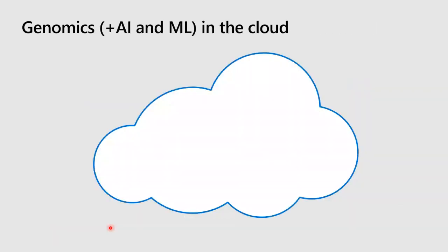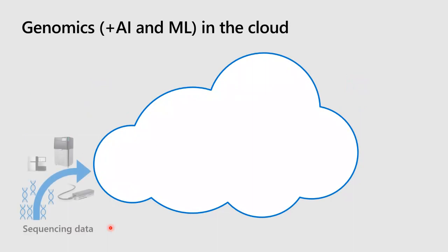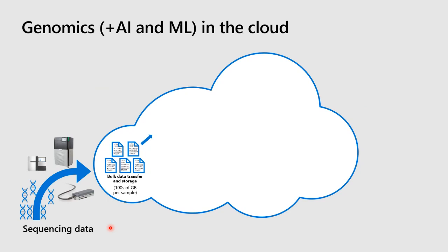So let's talk a little bit about what a typical genomics analysis pipeline looks like. We first start off with taking tiny pieces of DNA, and those are interpreted through a number of different technologies that ultimately generate tiny pieces of information of that 3.2 billion base pair DNA sequence that represents the genome of your cells.